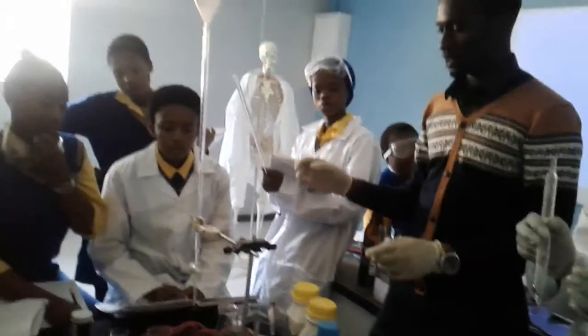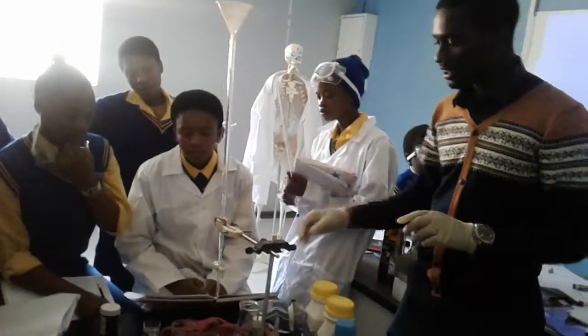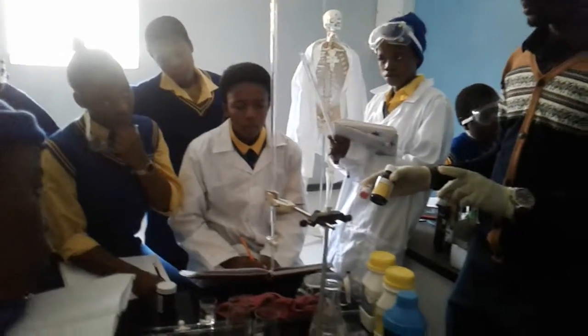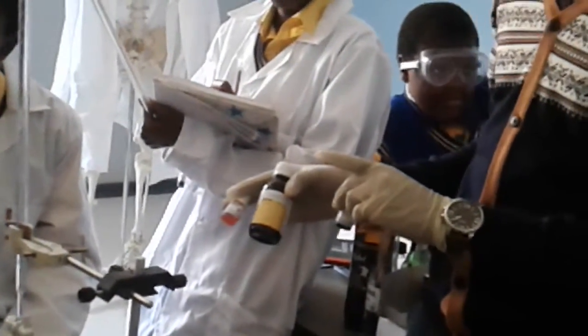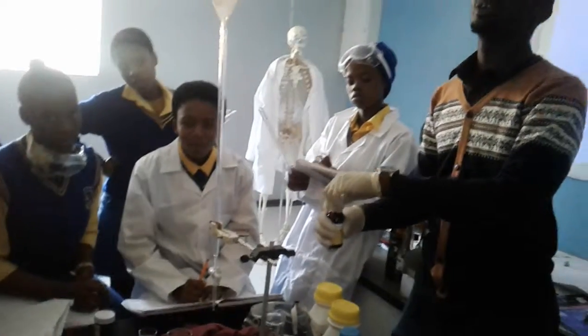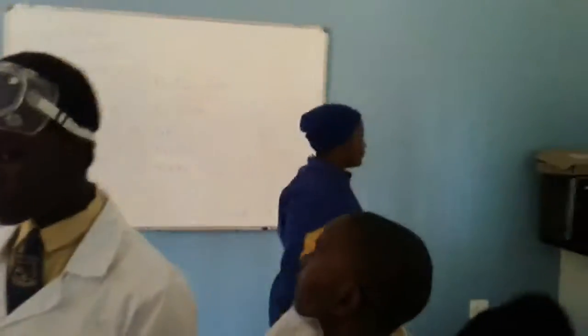Okay. So has anybody dissolved? That's fine. Okay. So which indicator am I gonna use in this experiment? What are we trying to indicate? Oxalic acid. Are we using that orange? Orange. Perfect. So when you use a weak acid and a strong base, you use what? Phenolphthalein. So with phenolphthalein, I'm gonna need a dropper. Okay. Go get me a dropper.